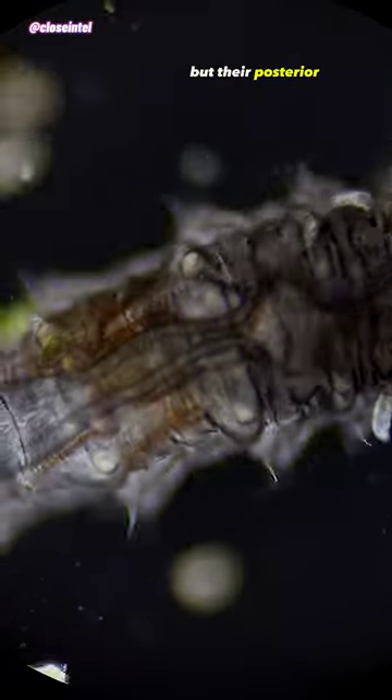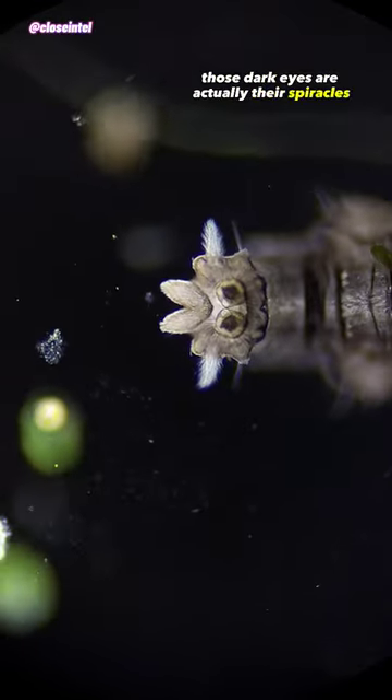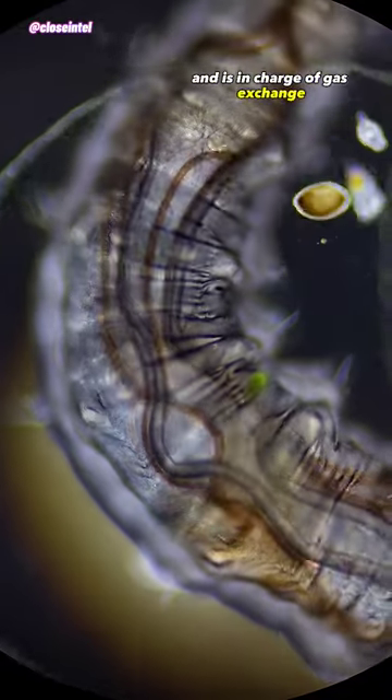You may have already noticed, but their posterior end somewhat resembles a face with two black eyes. Those dark eyes are actually their spiracles, which are openings to their respiratory system and are in charge of gas exchange, helping them breathe.